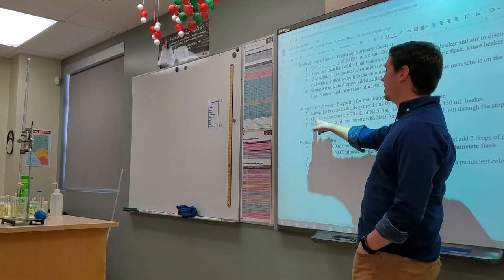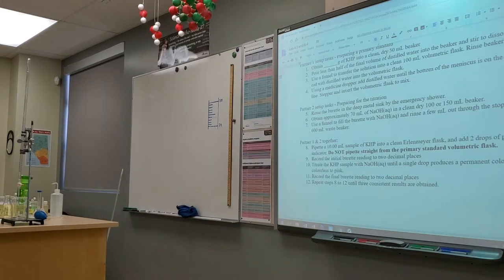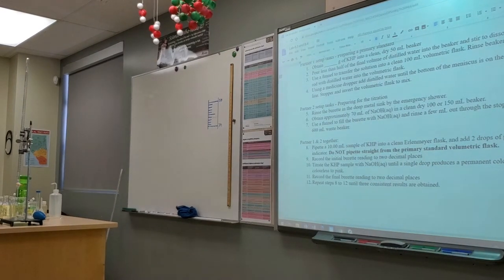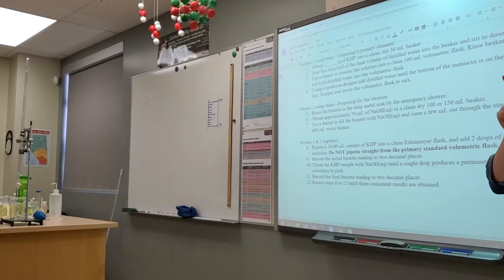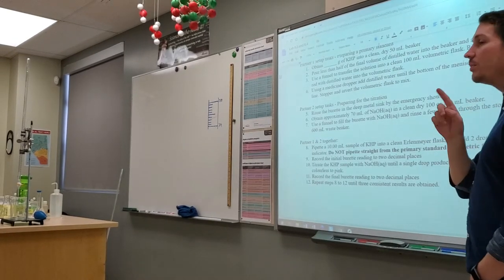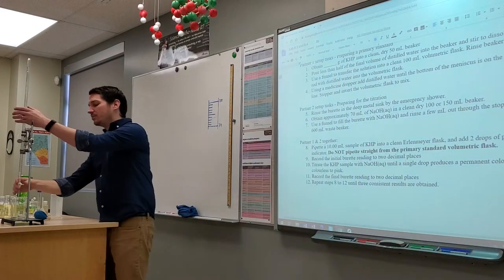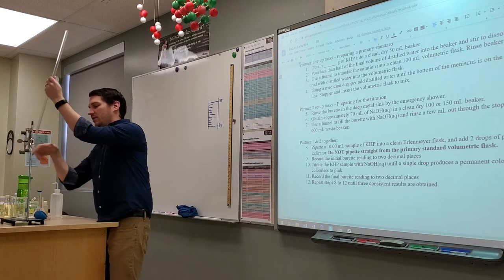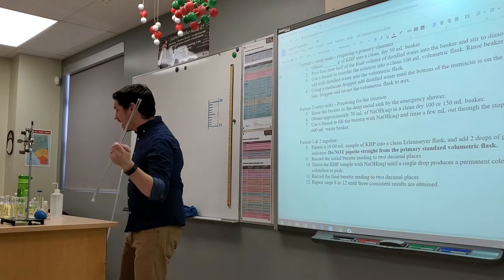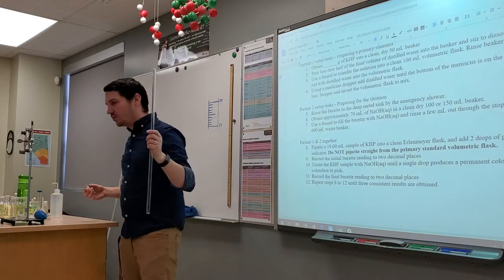Partner two setups. Rinse the burette in the deep metal sink by the emergency shower. Do you know what I'm talking about? There's a metal sink over there. Now, you don't actually have to do that, okay? What I would prefer you to do instead is you're going to have your burette. I'll take the stopcock out of this one. You're going to have your burette, and you have to choose an appropriate stopcock, okay?